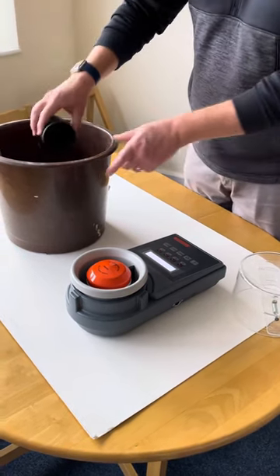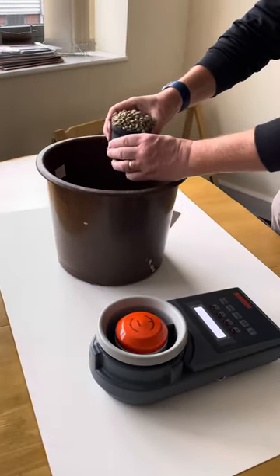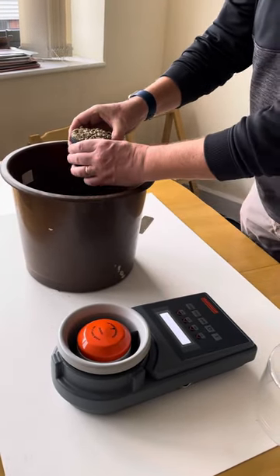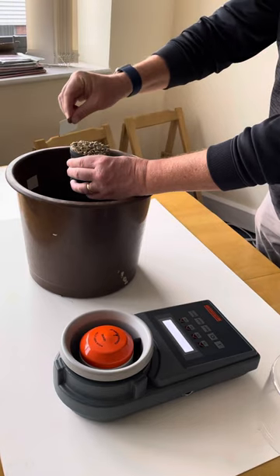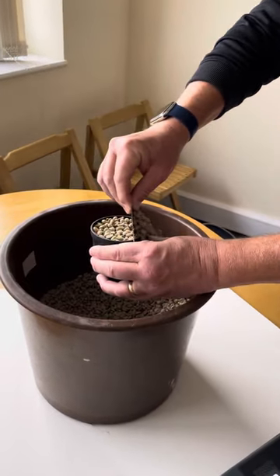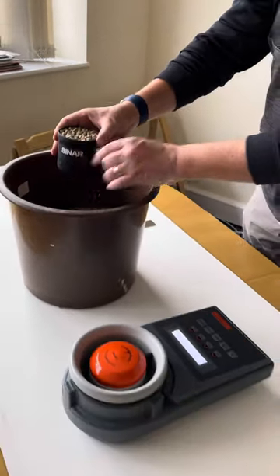So now we dip the cup into the green beans, make sure it's well overfilled. Just give it a little shake, and then using the strike off which comes with the 6070, just slide across until you have a level cup.